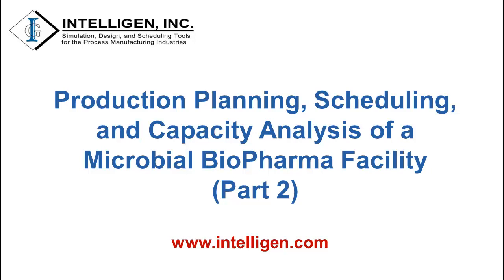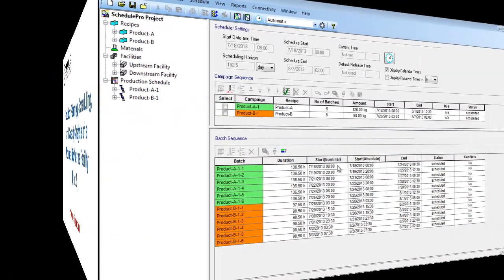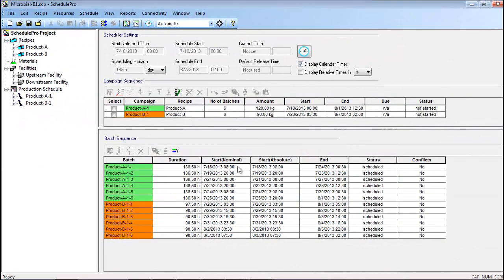Hello everyone. Welcome to Part 2 of the Microbial Manufacturing Example. The first case in this video, Case B1, represents two similar products called Product A and Product B.